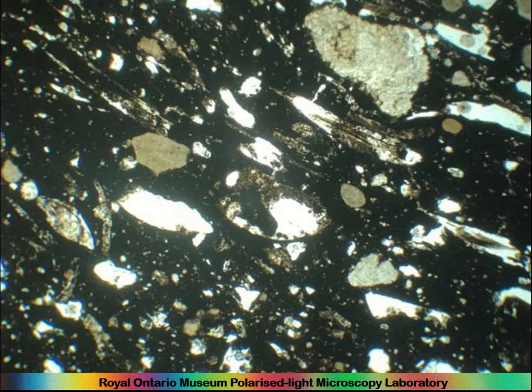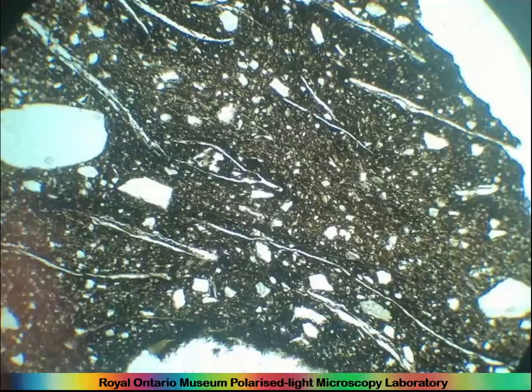And they often say, look at any plant void, any irregular void that looks like it might be from a plant, and say, oh, this is chaff tempered, when in fact when you look at things in thin section you can see all sorts of other types of plant fiber other than chaff, or certainly things which are not chaff, which are plant fiber. So there.